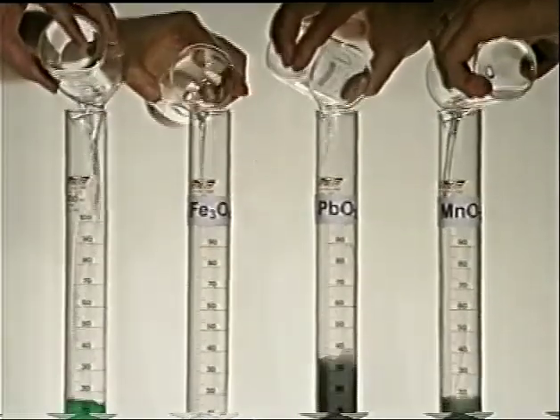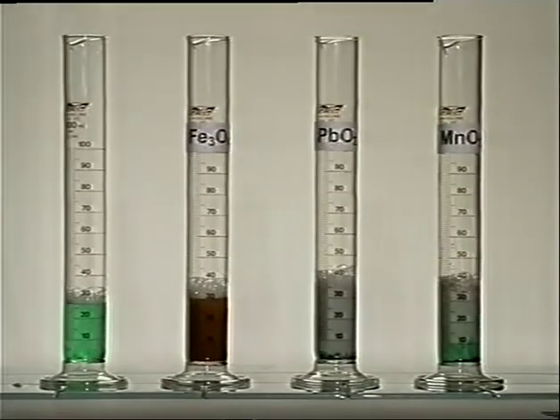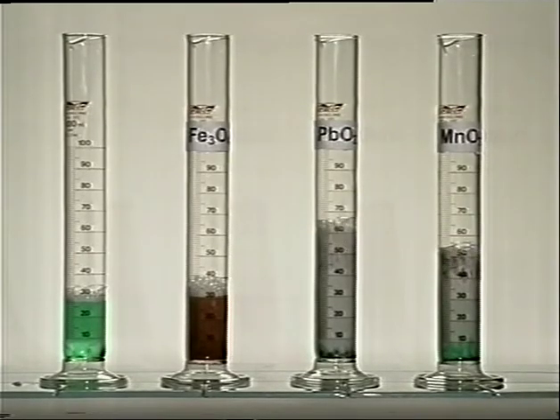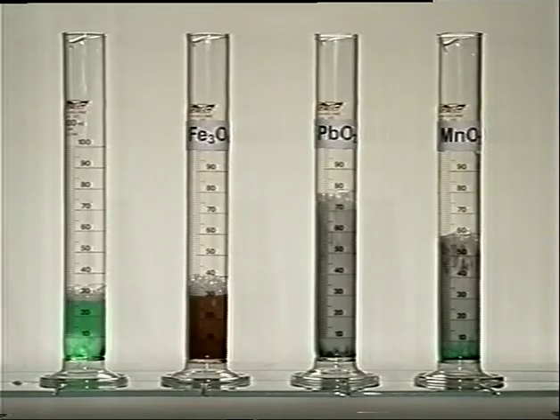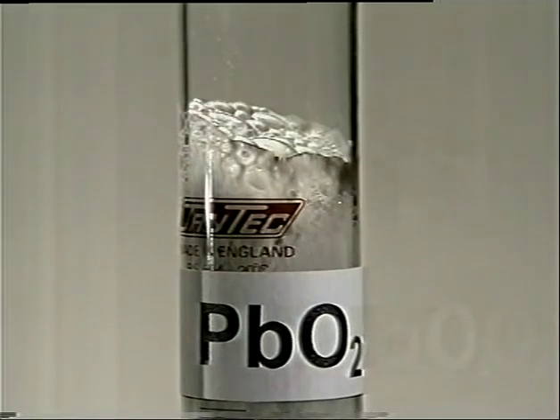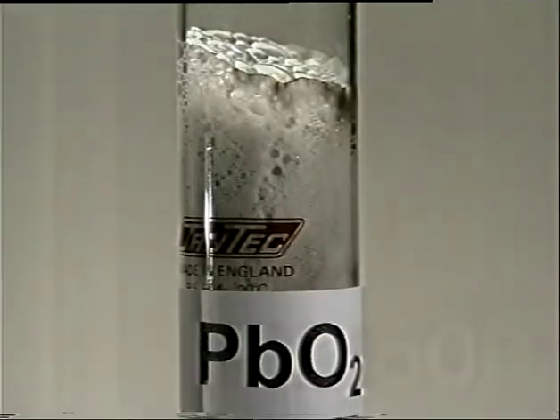Finally, in goes the hydrogen peroxide. As oxygen is evolved, the washing up liquid forms a foam which rises up each cylinder. The rate at which the foam is produced is a measure of how effective the catalyst is. Lead oxide is much better than the rest.